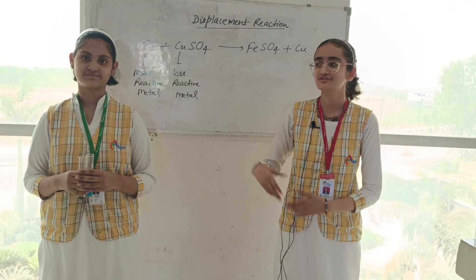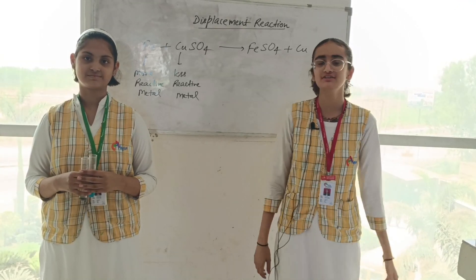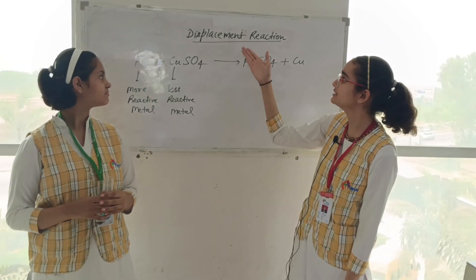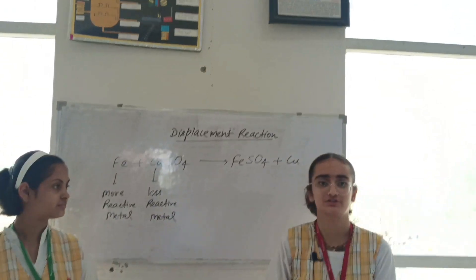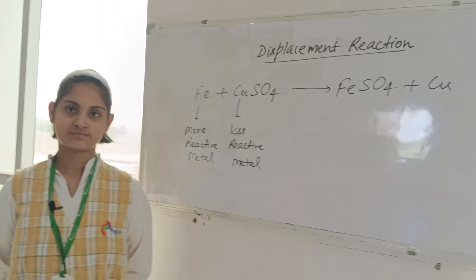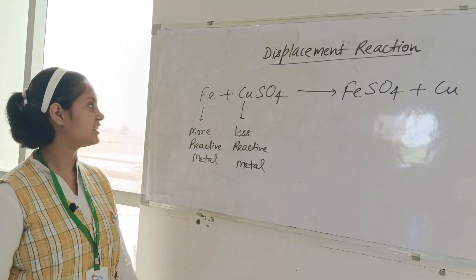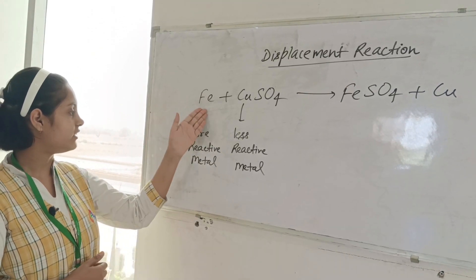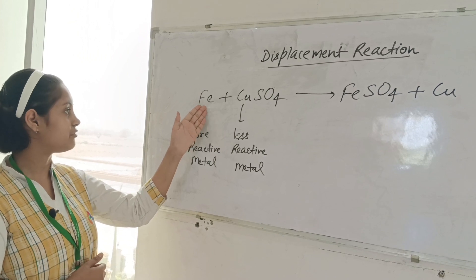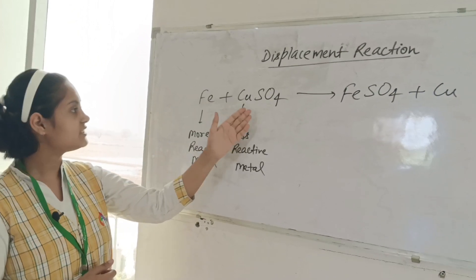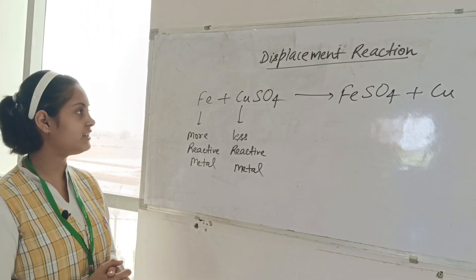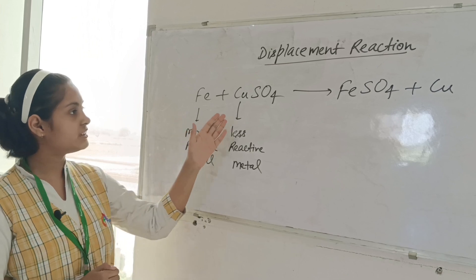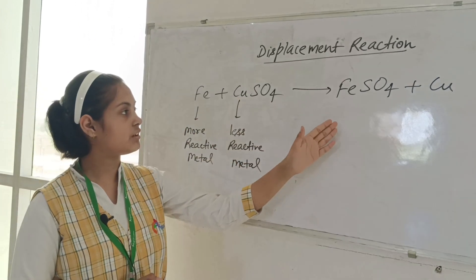Hello everyone, we are the students of class 10 and we are performing an activity regarding displacement reaction. In this reaction we have taken iron (Fe) and CuSO₄, which is copper sulfate, and in the products we get ferrous sulfate and Cu.